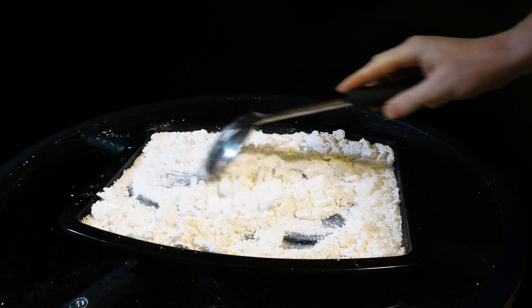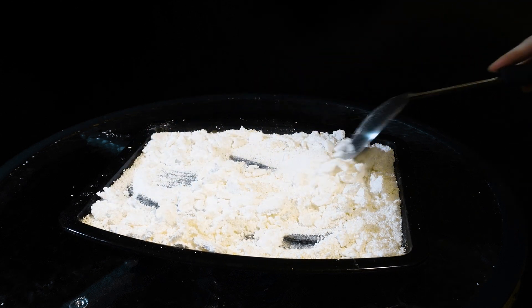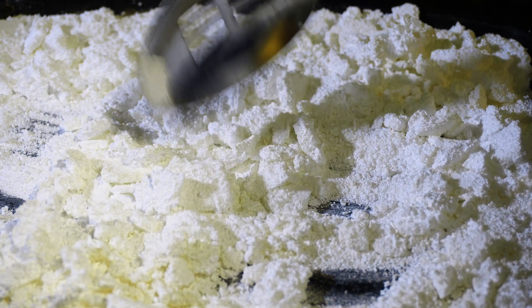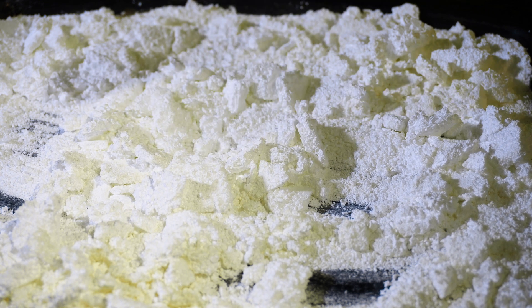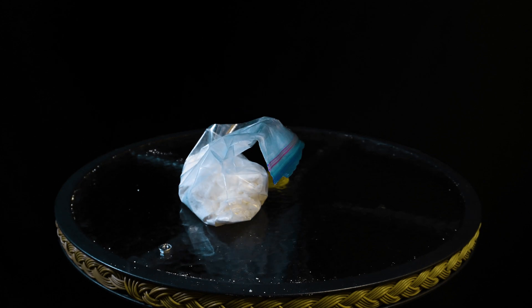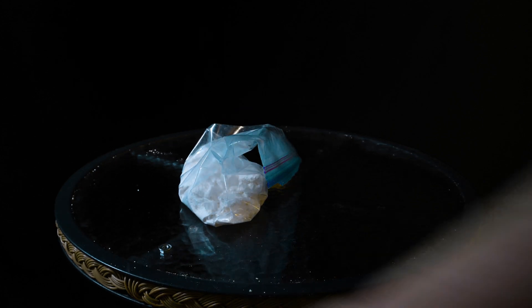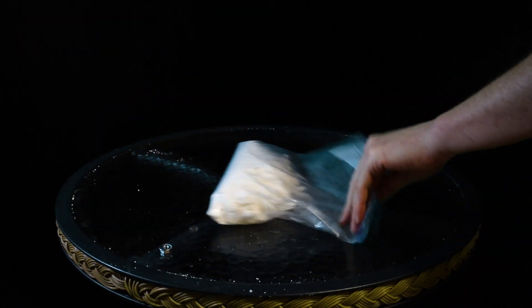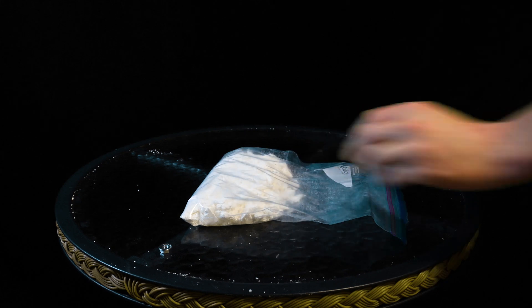After everything is finished it should appear to be in the form of dry granules. The larger chunks should break apart into powder with ease. Crushing up everything right away isn't necessary but I like to do it all at once — it's easiest to use a plastic bag for this. Use whatever you have available to crush everything into fine granules.